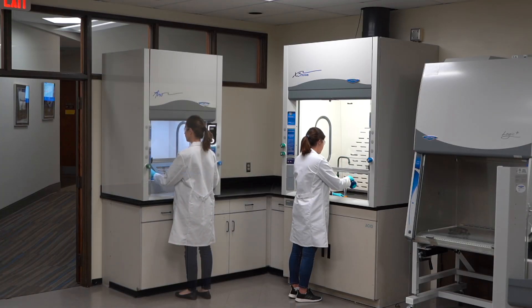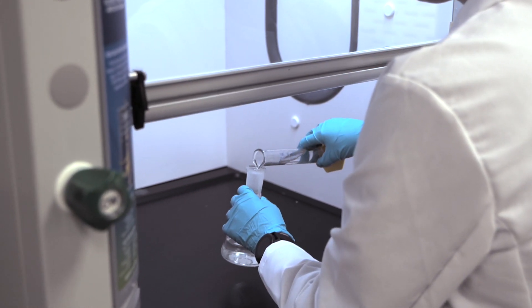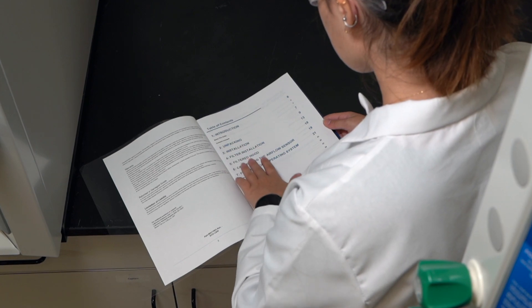Before you install your LabConco Protector Echo or Aero filtered fume hood, prepare the site for installation. Your user's manual lists the requirements for the installation site.